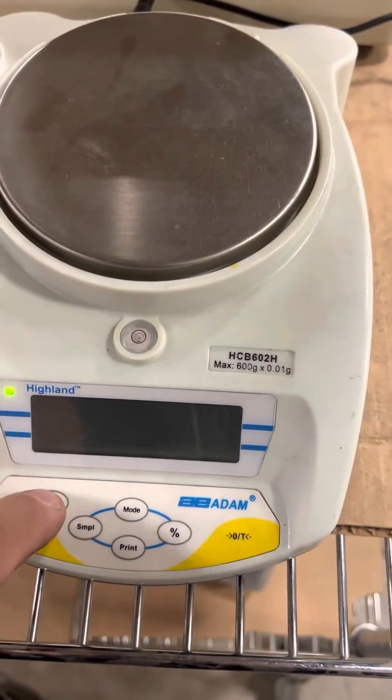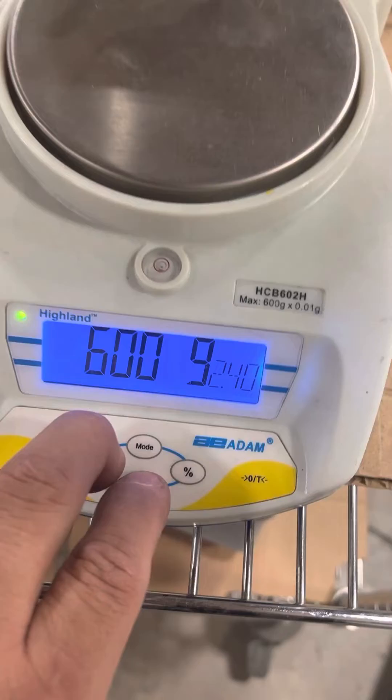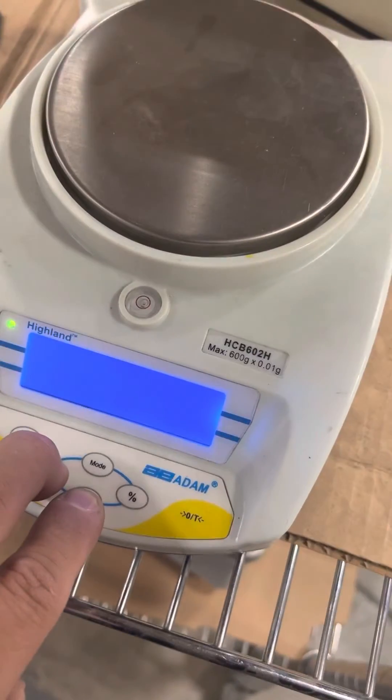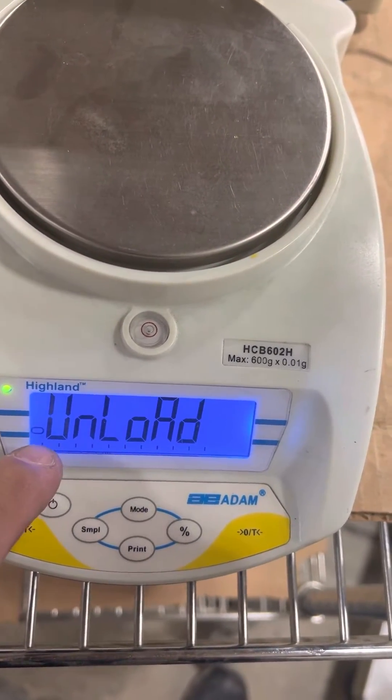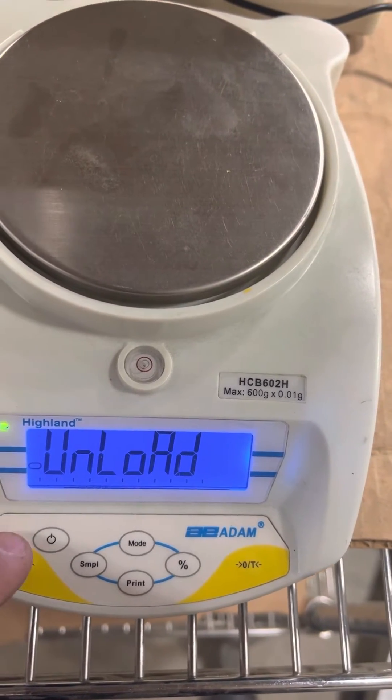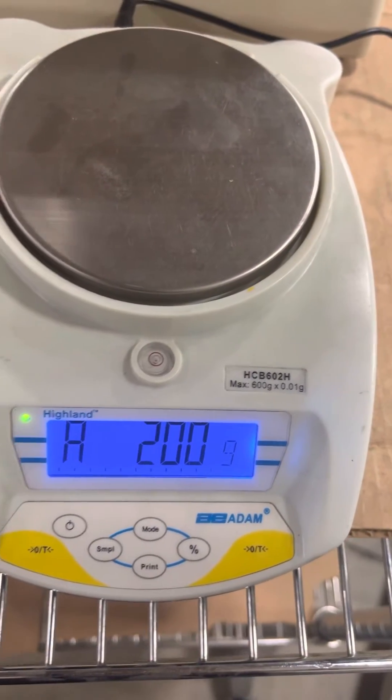Try it again. You'll get on load — you've got to wait for the stable. So that little stable display, once that comes on, then you press the tear. That's for the zero.